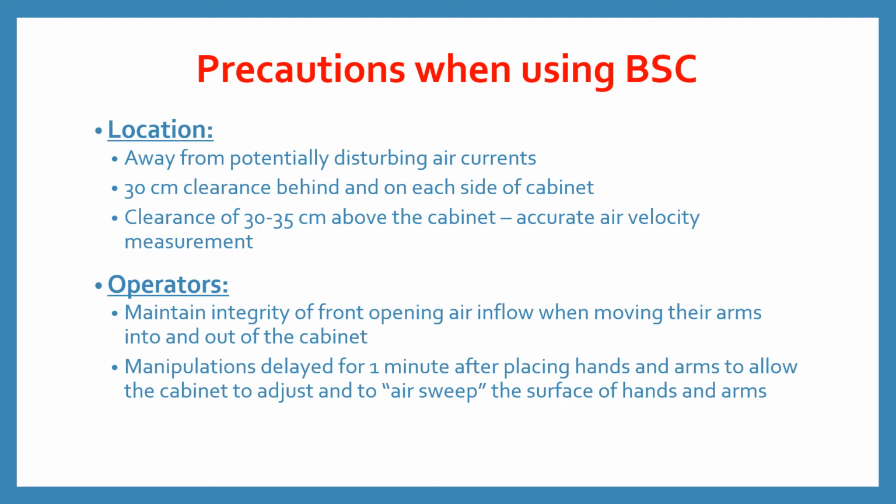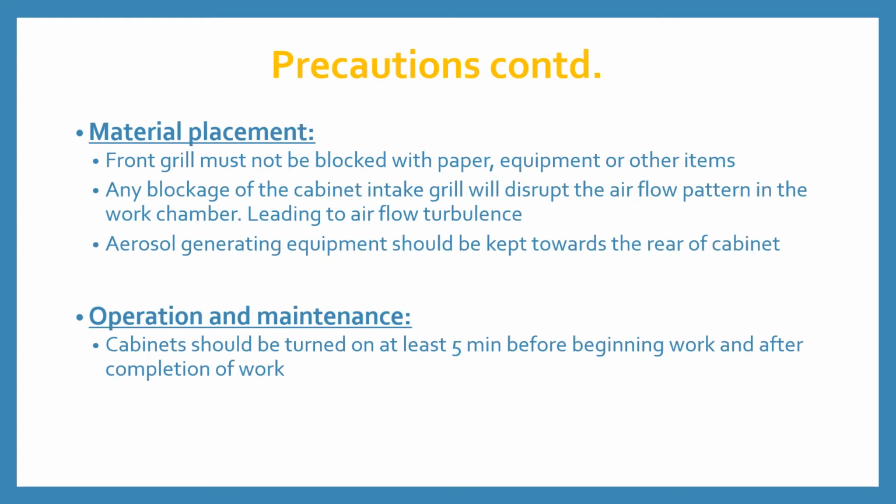Operators. They must maintain integrity of the front opening air inflow when moving their arms into and out of the cabinet. Manipulations must be delayed for 1 minute after placing hands and arms to allow the cabinet to adjust and to air sweep the surface of the hands and arms.